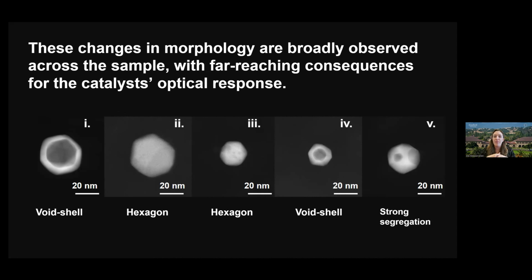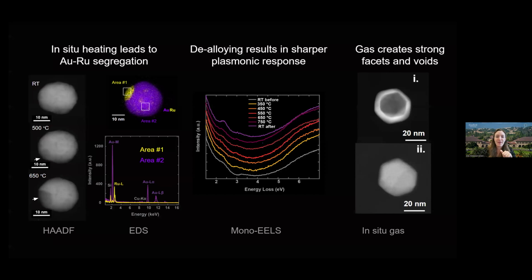So this has some broad implications for how these are going to behave as catalysts. We observe a variety of morphologies. They are not all this kind of void formation, but all have this hexagonal morphology. So we're excited to study definitely the optical responses of this going forward, because the sharpening of the facets will change the plasmonic response, as well as the surface area for catalytic chemistry.